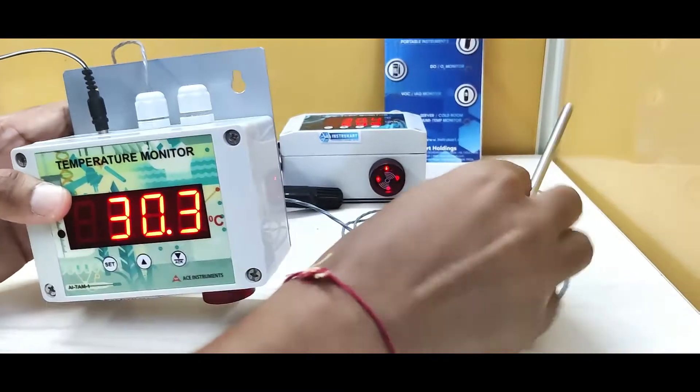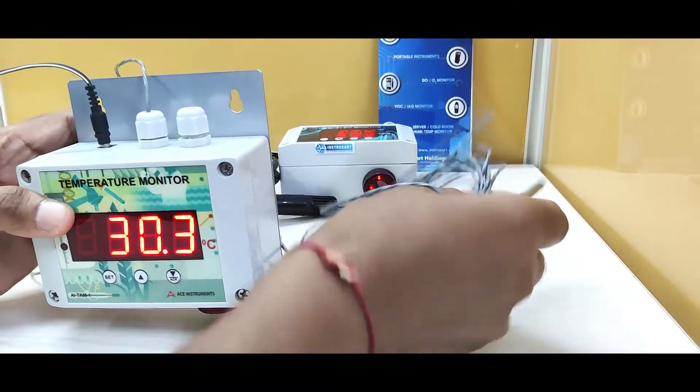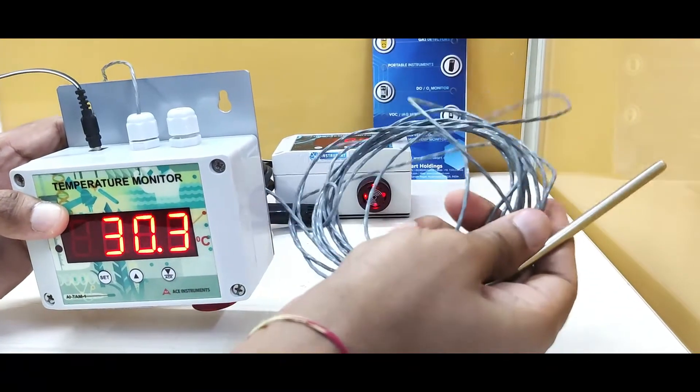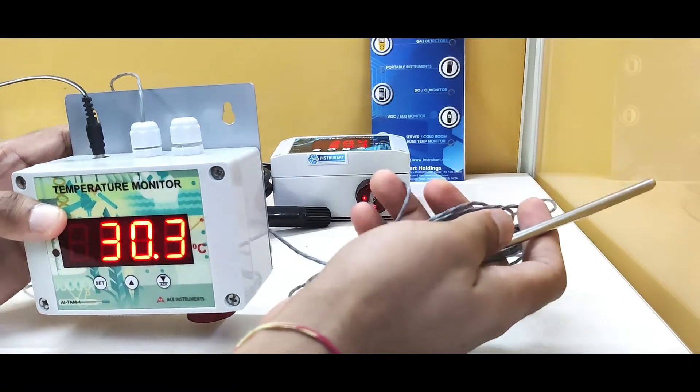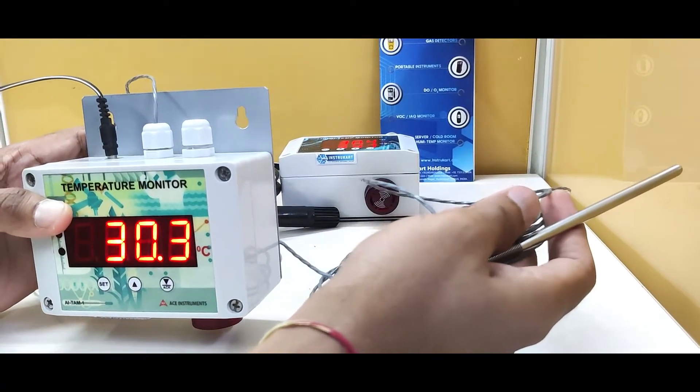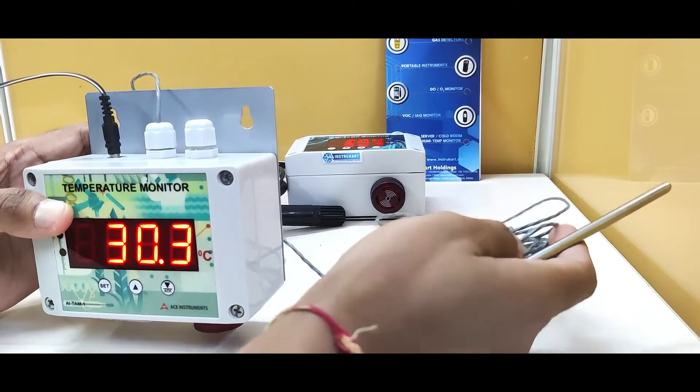For the wire between the temperature monitor and the sensor, you can customize the length anywhere from 1 meter to 15 meters, which is the limitation.